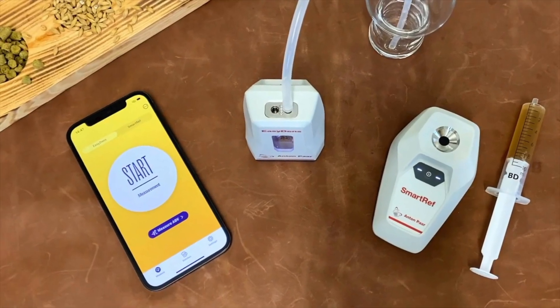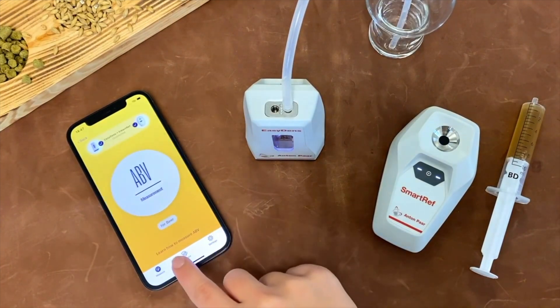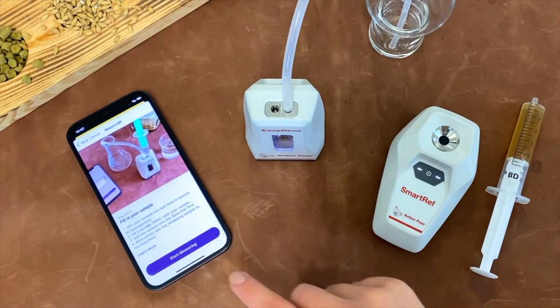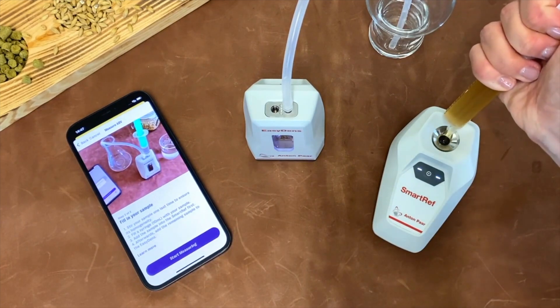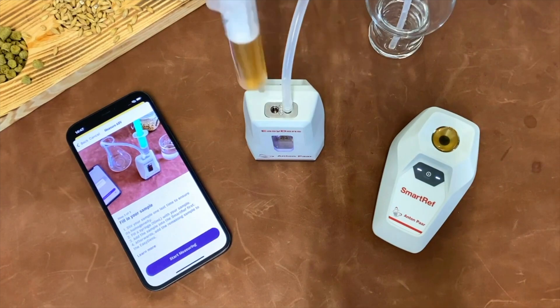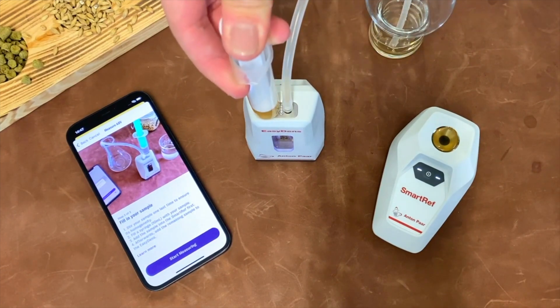You will begin by switching on both devices and connecting them to Anton Parra's Brewmeister mobile app. Then within the app, you can navigate to the measuring section to measure ABV. Follow the menu until you reach the start measuring step. At this point, you should then add your beer sample into both devices according to the device, ensuring that all of the usual steps are followed in advance to ensure that the devices are clean and ready to offer accurate measurements.